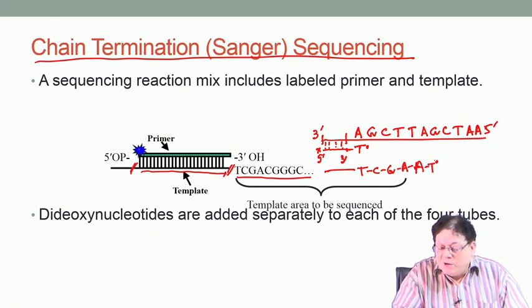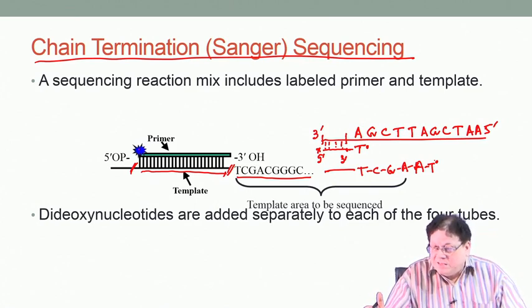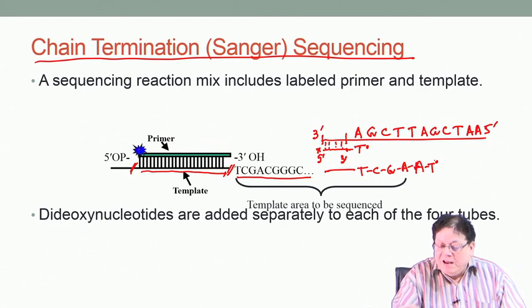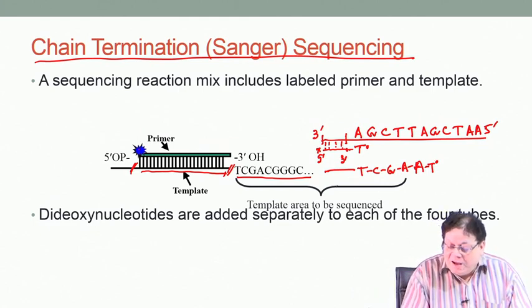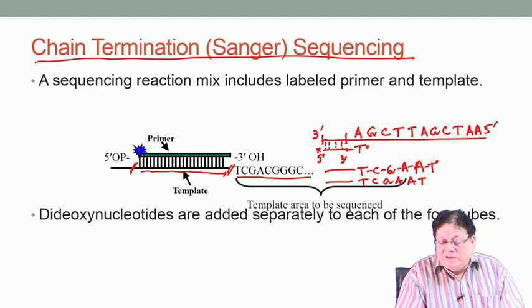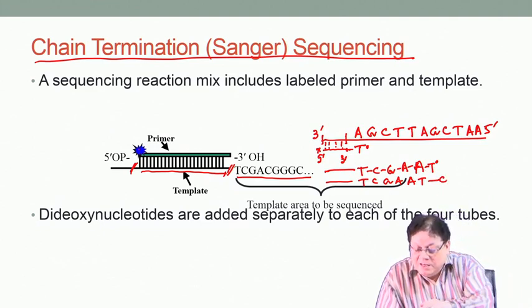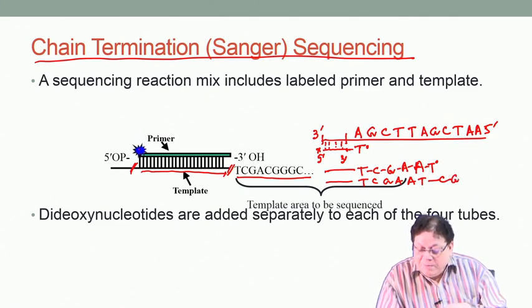So, you can have 2 truncated chains, you can have more also if there are more A's, because it depends on the number of A's in the chain. So, you will have others also. T, C, G, A, T, because when the correct T is taken, this is going to proceed forward. Then C, then G, then A, no problem.